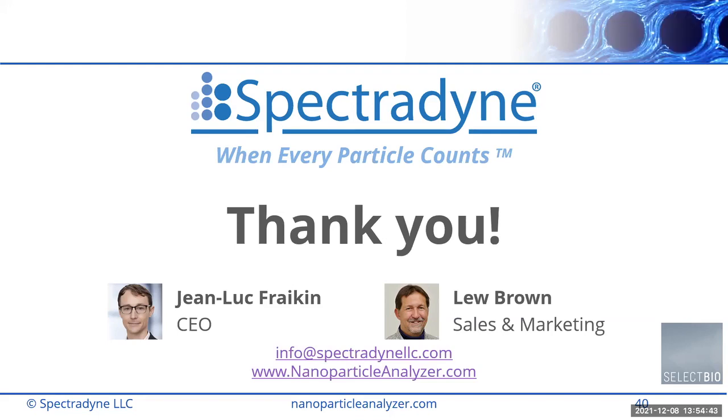Good. All right. So a question for you about some of the imprecision that we're having on our particle counts. Like we'll run the same sample a few times and it can be pretty different results. So I get how the measurement is going to count absolute number of particles. I'm good with that. How does it measure the volume? And is that maybe where our reproducibility issues are coming from? Is just the volume is different from sample to sample?